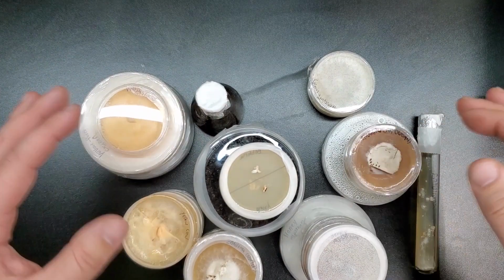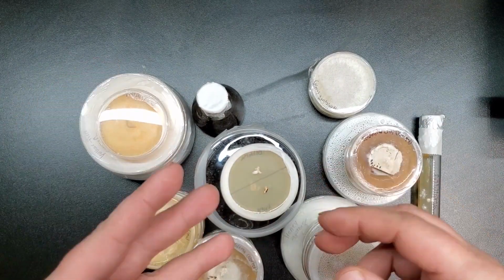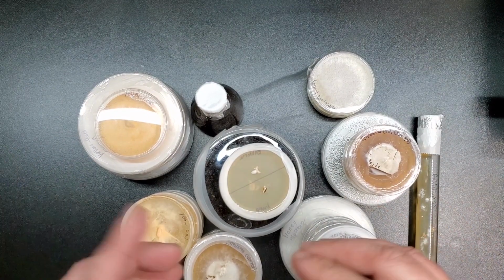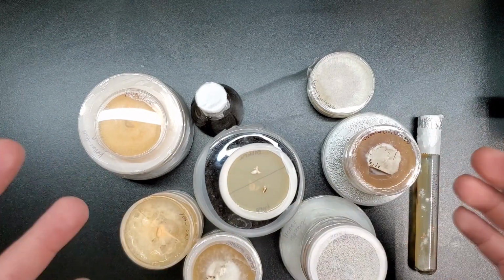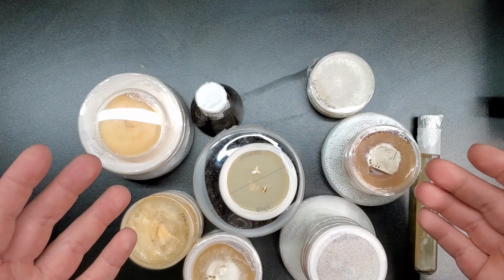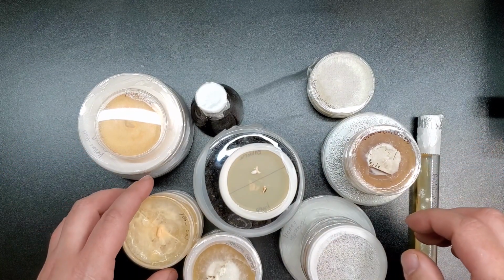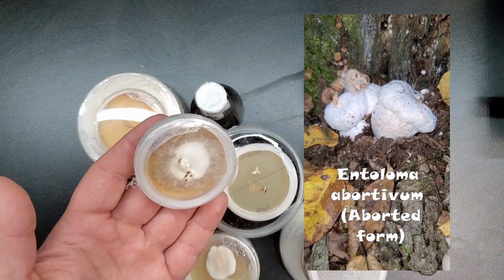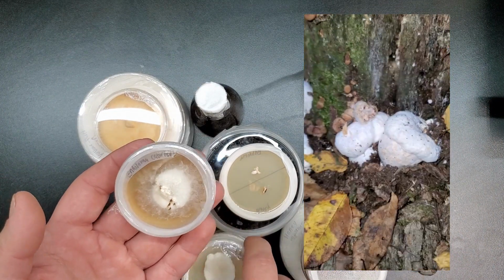Wow, there's quite a bit going on here on this table now, huh? This is actually a little bit of an update from my cloning wild mushrooms onto agar video I did, what, 2.5 months ago or so? As you can see, quite a bit has happened since then. Let's just start with these guys. These are the aborted form of the Entoloma abortivum.